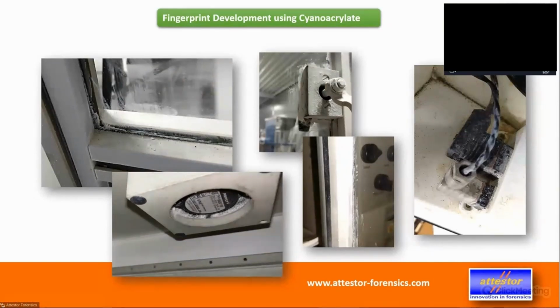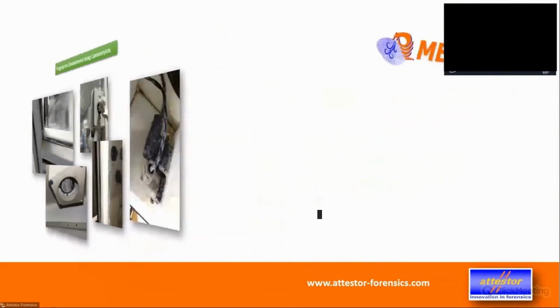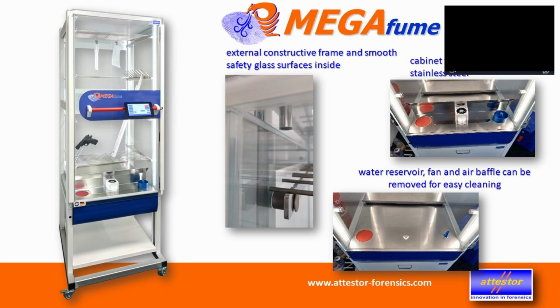So we said the absolute best would be a self-cleaning chamber, like having an integrated dishwasher in there. Unfortunately, that's not so easy. But we tried to make it as good as possible. So what we did is, if you look at our MEGAfume series, and that's valid for all the 3 sizes that we offer, we have an external steel frame, a very solid one, and we basically hang glass screens from inside the skeleton framework or whatever you want to call that.